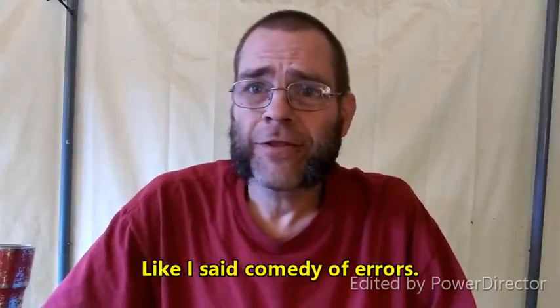So anyway, I've done this reaction twice now, and filmed the vast majority of the second time. I lost the first clip of it somehow. So, rather than try to set it up and make it all fake, which I just don't do well, I'm just going to tell you about it, and we're just going to start from where I have footage, which is literally just making up the first solution, so you're not missing anything. But anyway, anthranilic acid, the royal pain in my ass.